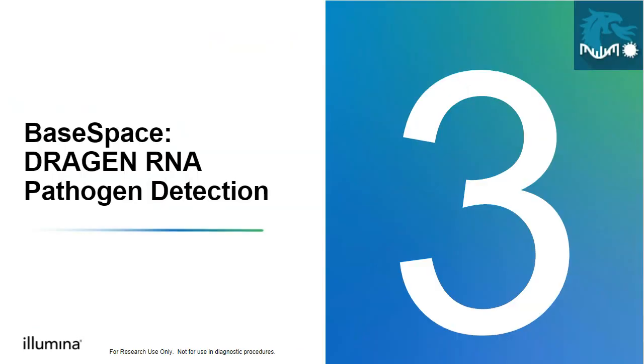Okay, so that was the DRAGEN Metagenomics App. That was one of the examples of the analysis methods used for shotgun metagenomic sequencing.